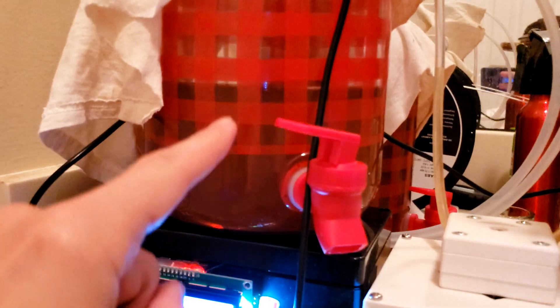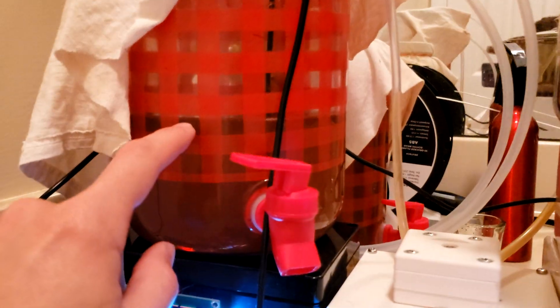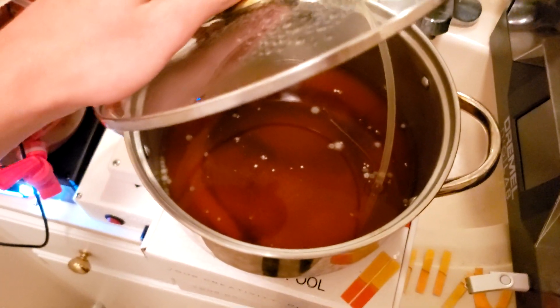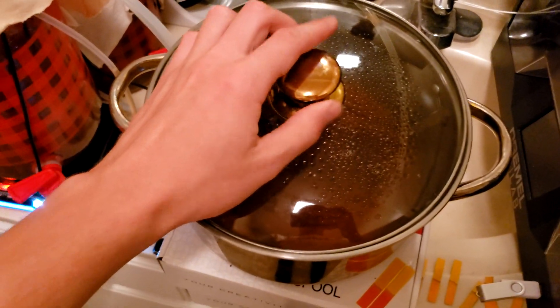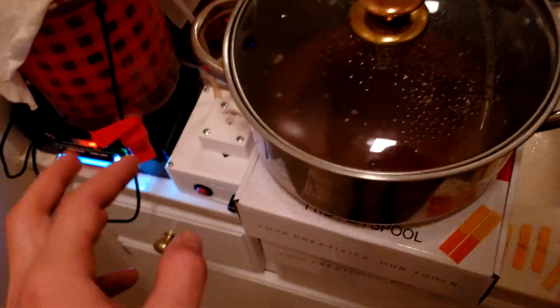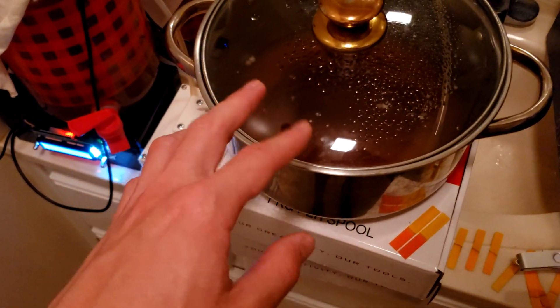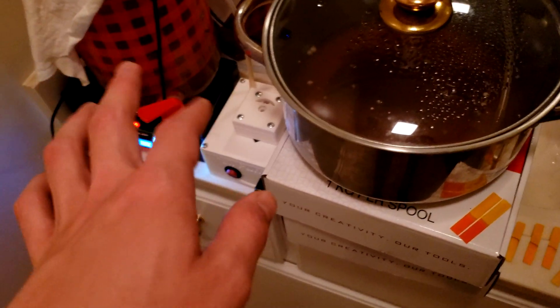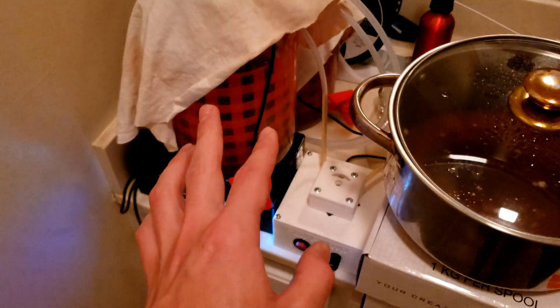And there's a lot of places I messed up. So let's go through a few of them. The first one is I stopped this batch process a little bit early. You can see the level only got to maybe a third of how full it could have been. Because the tea that I was using got a little bit of contamination in there. I wasn't planning on drinking this anyway, so it's probably not that big of a deal. And it was inevitable. And I checked the pH of this and the pH is neutral. So there's no issue there with skewing the results at the very least.